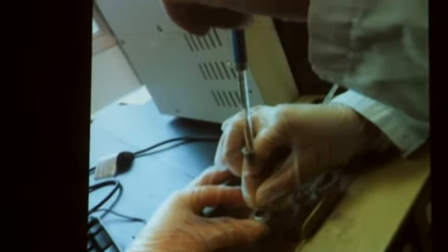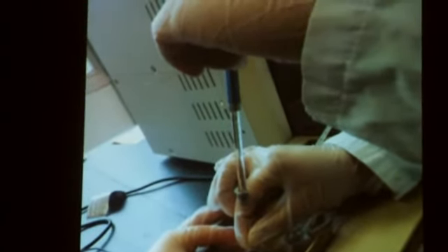And for injecting it into the vials, make sure you hold the needle from the bottom so that you don't break it. Inject it into the headspace air and take out just the air and not touch the liquid. Before doing it, draw a few more times before actually taking 10 microliters out of it. And then quickly inject it into the machine.